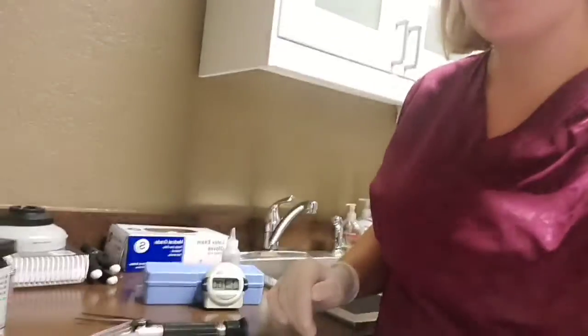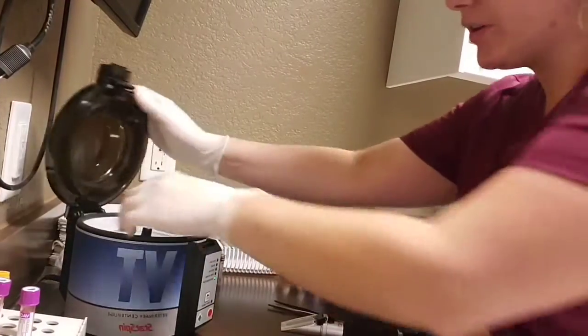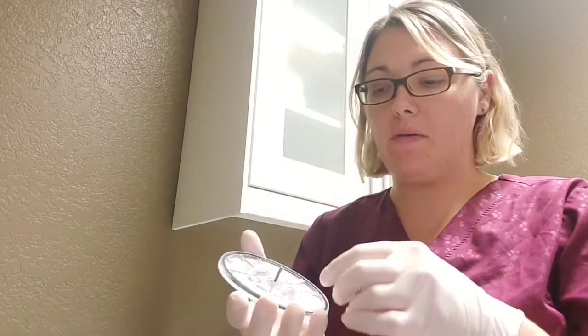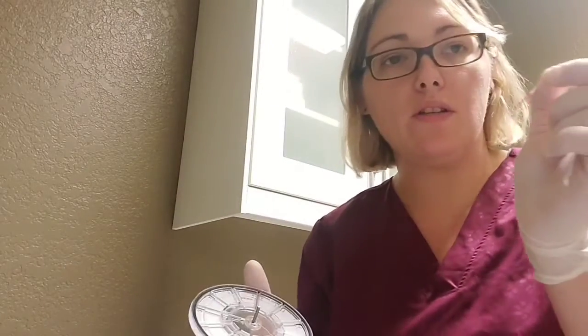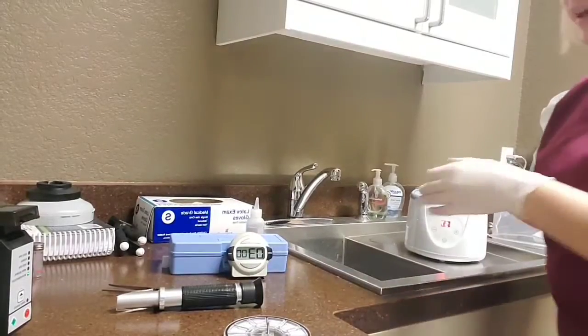Alright, so it's just finishing up its spinning here. So what we're going to do is take this out. And when taking this out, I'm going to start incubating my one tube. We do want to incubate one tube in our water bath for 3 minutes. So I'm just going to come over here to our water bath real quick.